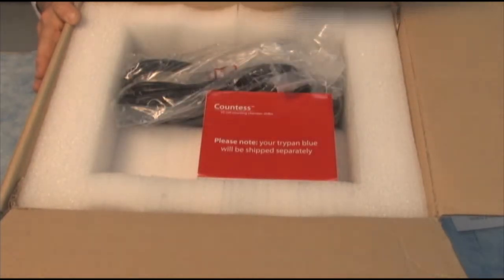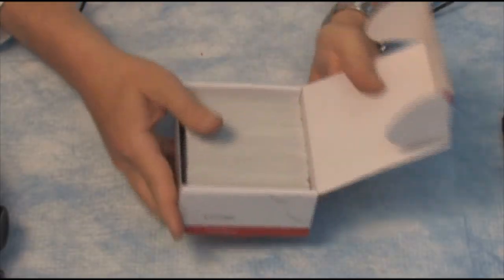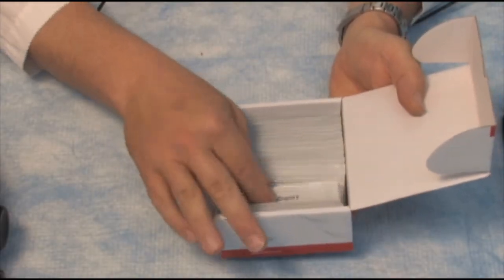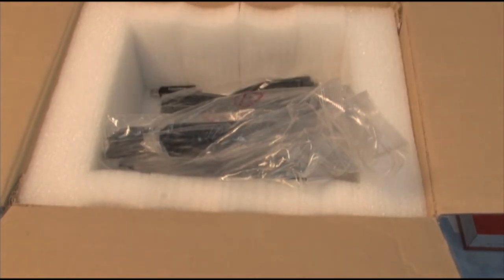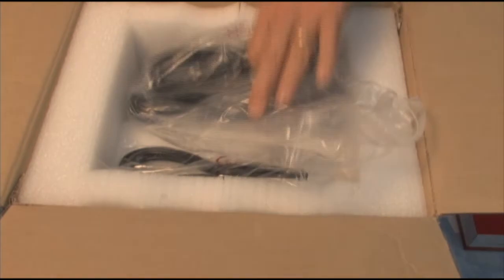Also I see there's the quick reference guide. This is going to be very helpful. Comes with this box of slides as well. There's a power supply I see, and several international power cables. And I'm going to use the US version right now.